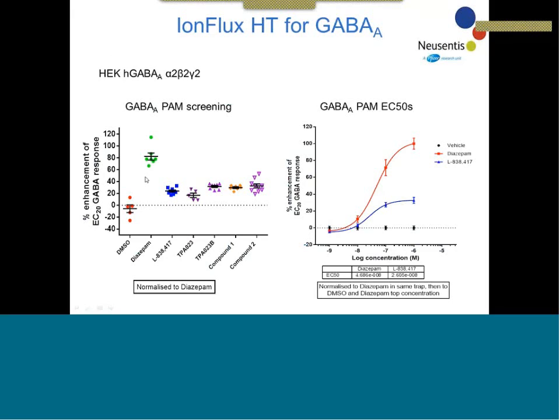These responses have been normalized to the first diazepam response within the same cell, and because we're getting some desensitization and an imperfect washout, perhaps, in the case of some compounds, diazepam comes down to about 80% of the initial diazepam response. But this is pretty typical and would happen on manual patch as well.